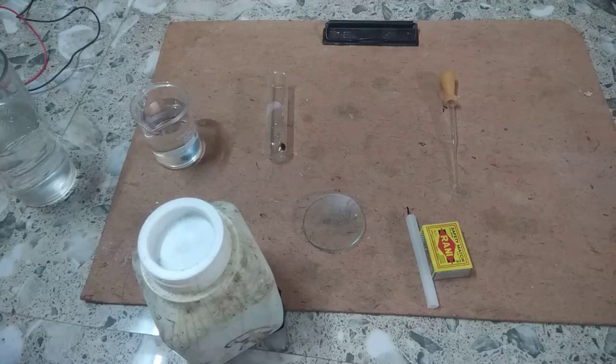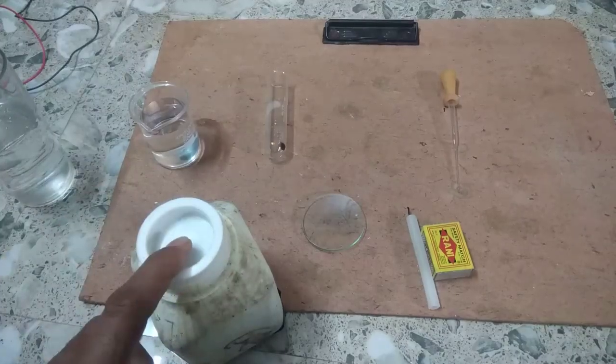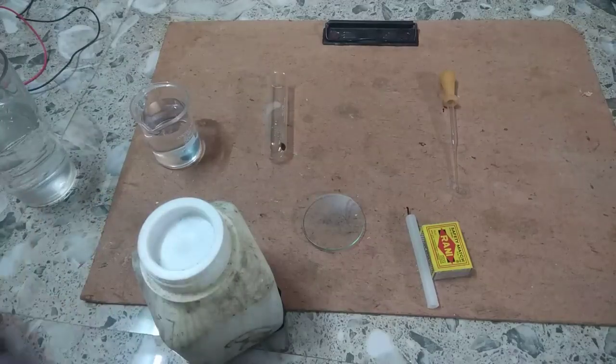Now let us take this copper sulfate in a test tube and heat it and see what happens. First of all, we take a candle.